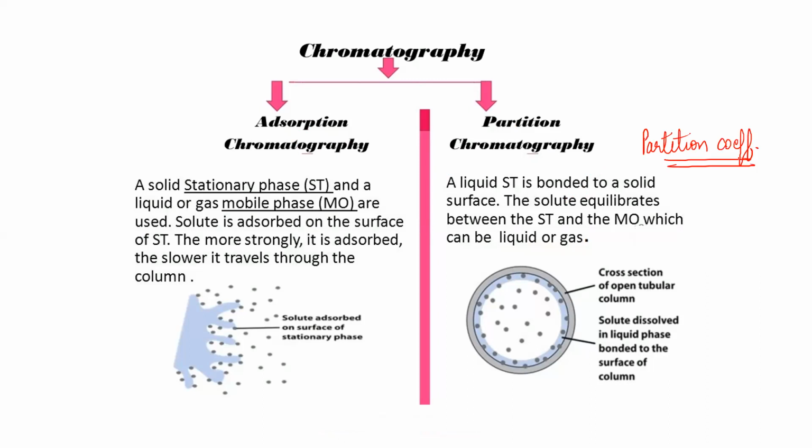So you have been given a mixture of things and you have to separate one of them. It's not so easy, and that's why we are taking the help of this technique to separate your analyte of interest from the mixture. So again, there is a stationary phase, there is a mobile phase.